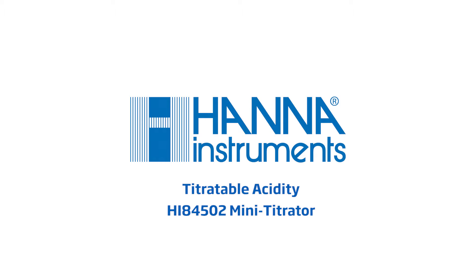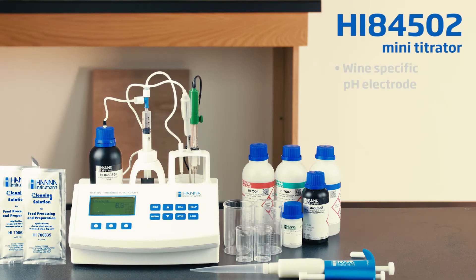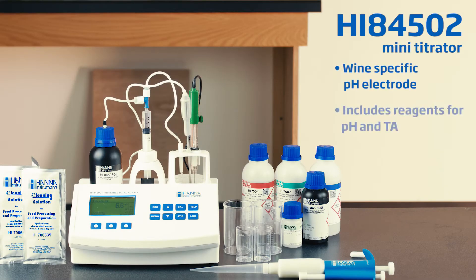The Hanna Instruments HI84502 Mini Automatic Titrator simplifies your wine analysis by integrating both titratable acidity and pH into one unit. In this video, we will assemble and prepare the mini titrator for calibration and measurement.